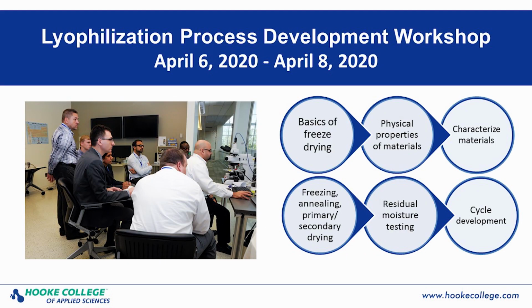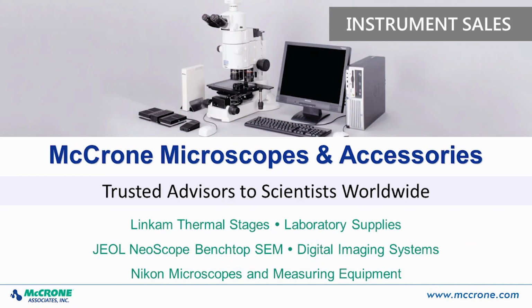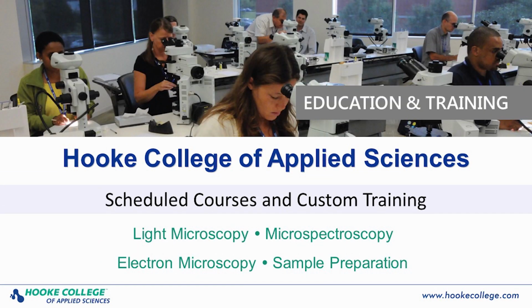So in that case, it may be more convenient in general to use the KV based on the inlet temperature. Again, for the transfer example we had here, we had a heat flux sensor in both our source and target unit, so it was easy to use our surface temperature, but that is likely not the case for most applications, in which case we would probably recommend using the inlet temperature as your KV basis.